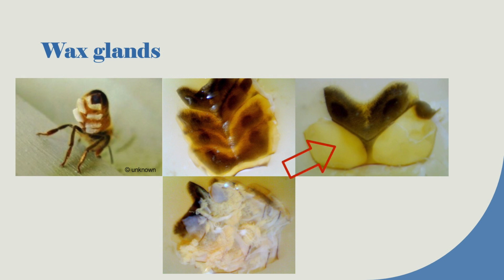This is what they call mirrors, and the mirrors sit underneath the cuticle of the previous segment, and the glands, well, you've got to look upside down, you have a big thickening of fat body, or equivalent of fat body, above, and it basically produces the chemicals. And as they ooze out, so this is fat body, the yellow here, and as it oozes out, it turns into wax, solidifies, and it comes out in the segments.